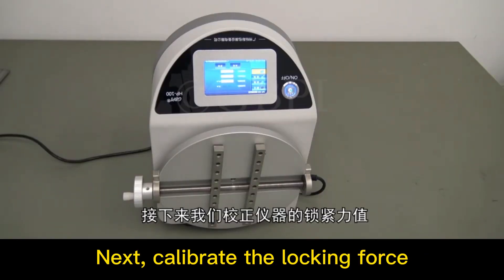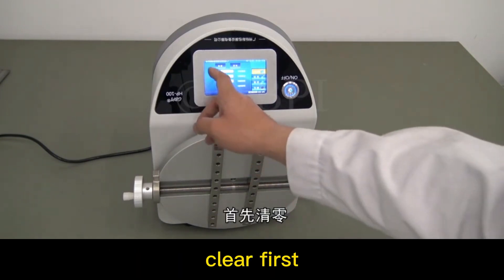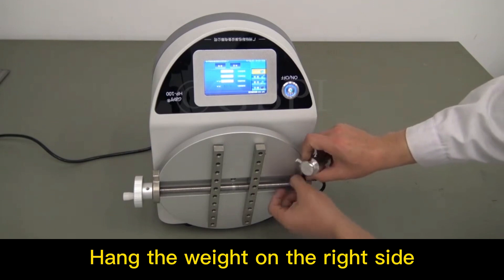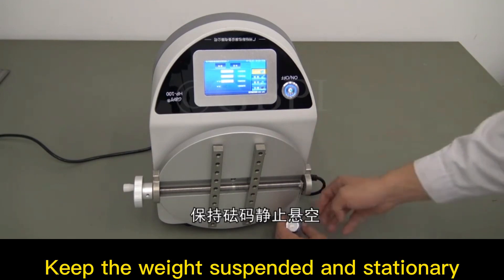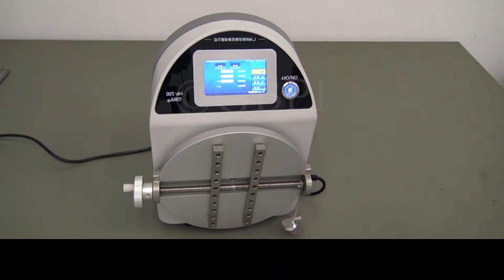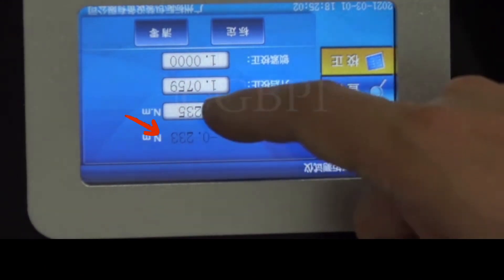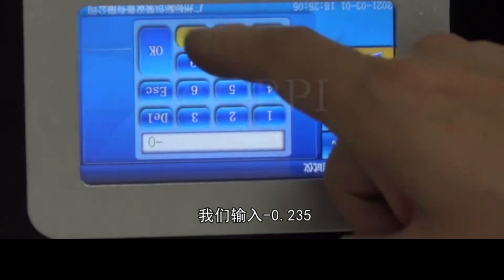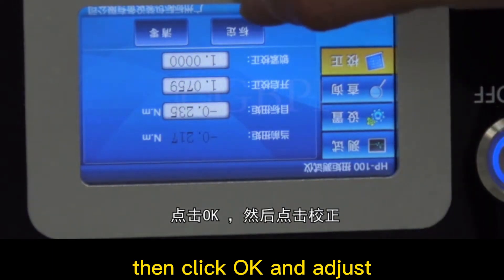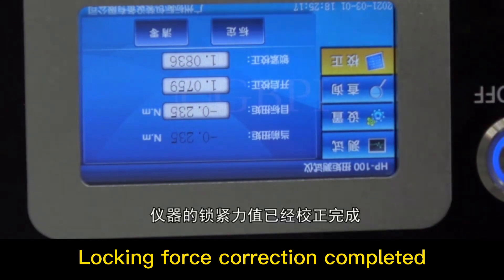Next, calibrate the locking force. Clear first, then hang the weight on the right side. Keep the weight suspended and stationary. The target torque should be negative 0.235. Input negative 0.235, then click OK and adjust. Locking force correction completed.